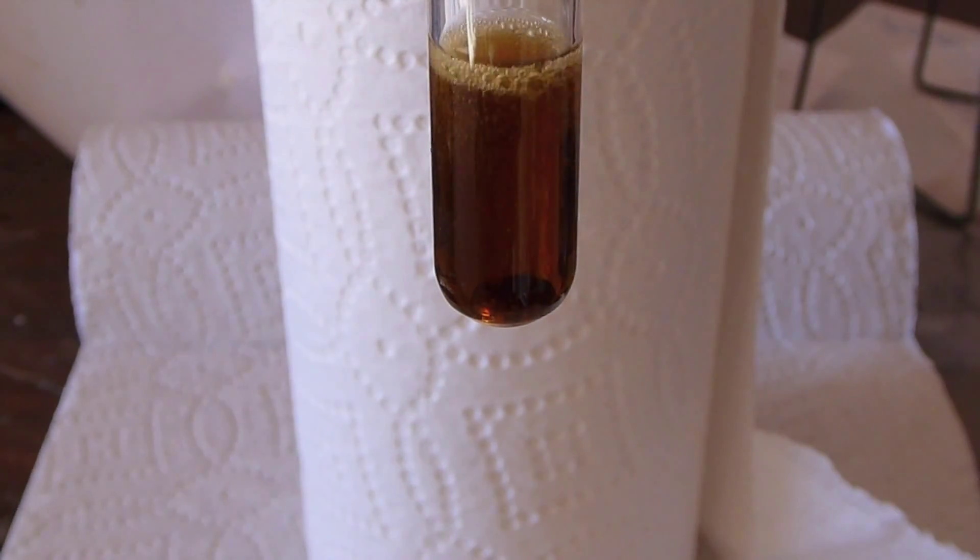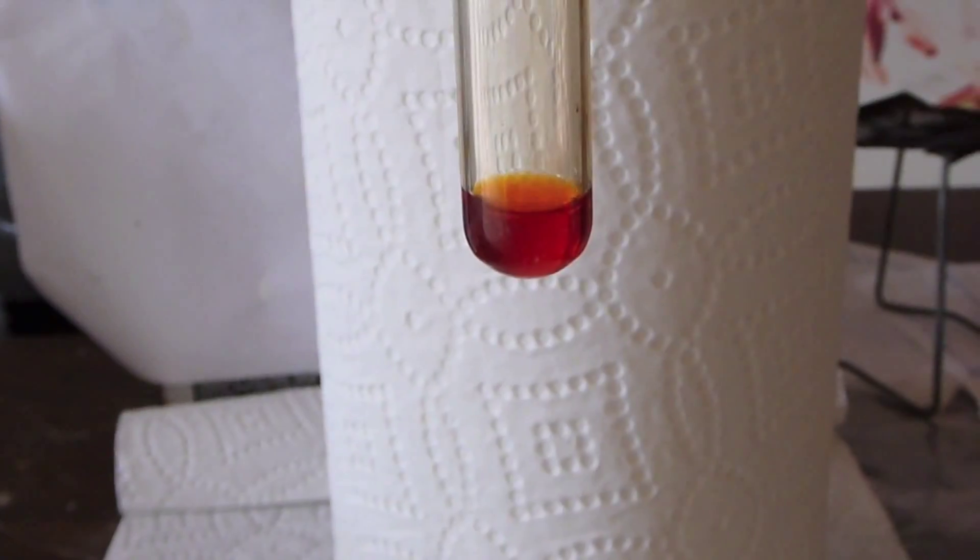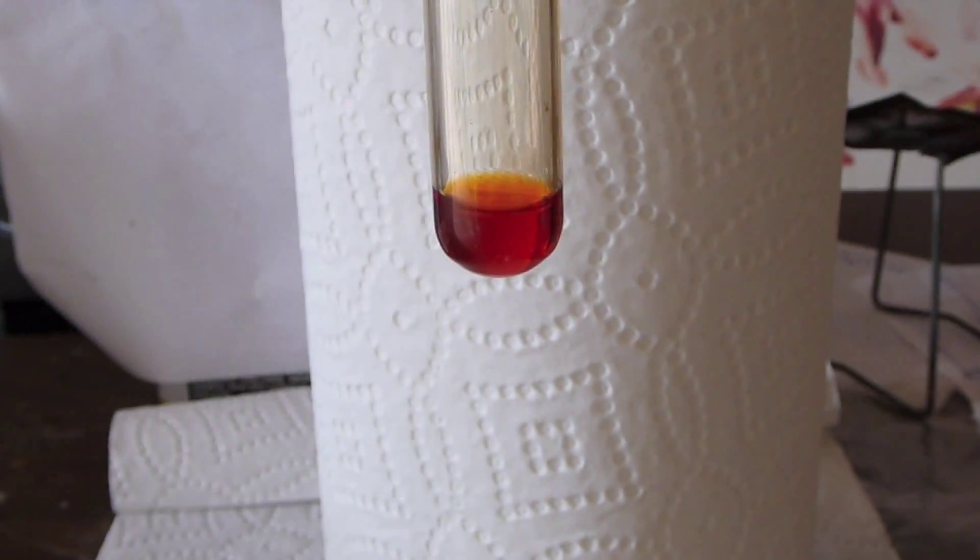Now, because the solution is alkaline, there are plenty of OH groups running around, and the perruthenate will oxidize the OH groups, reducing itself and forming ruthenate. So if you let the solution sit out for a while in alkaline solution, you're going to get pure ruthenate, and the solution will turn a nice orange color like this. So this is pure ruthenate.